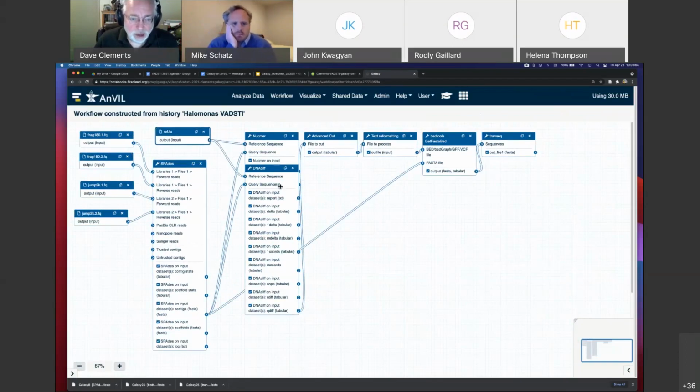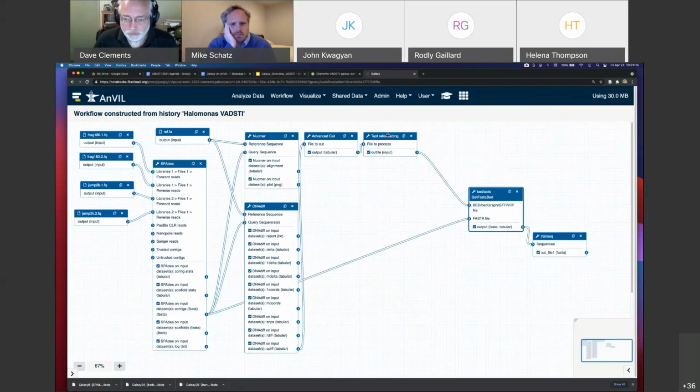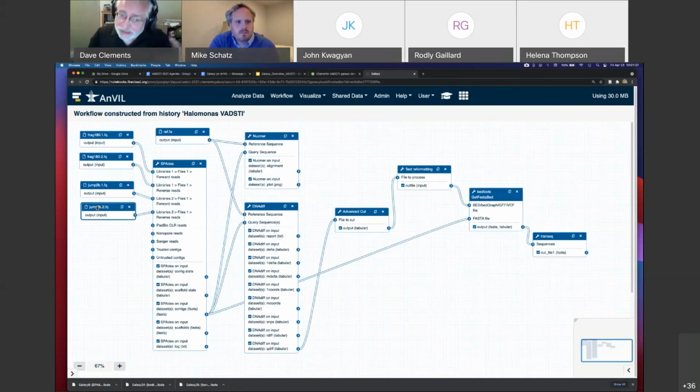And then it looks like, yeah, okay. Drag that over. Okay. Now, with just a little bit of playing, I've been able to see what this workflow actually does, what I did in my history, which again, it's easy to lose track of while we're in the heat of it. I had 4 inputs here, which got fed into spades, and they were as 2 libraries. Good. Spades produced 1, 2, 3, 4, 5 outputs, of which looks like I used 1.